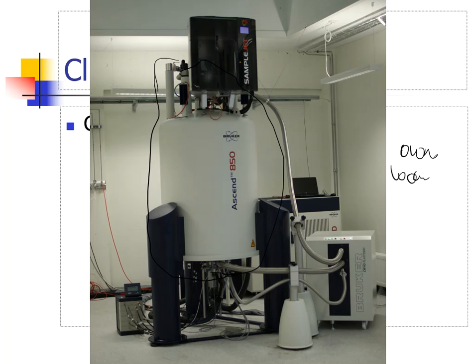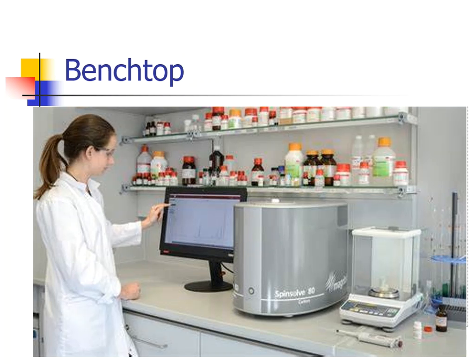So these big instruments are more for research and development type of purposes, industry, universities maybe that are doing some research and development type of things. However, we know that something like this is not very applicable in an academic setting. And because of that, we have a different variant or version of NMR that you might see in a laboratory, and it could look like something like this. They are very tabletop. Notice the computer is basically right beside them. These are not massive. They fit on a countertop, as you see in the picture.